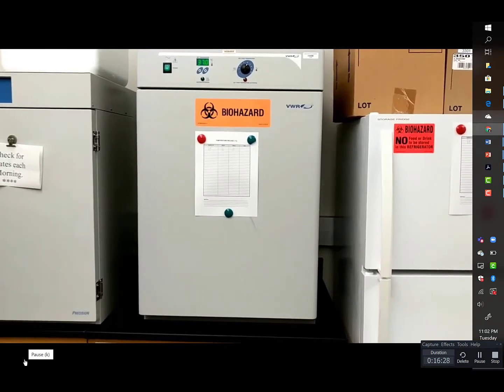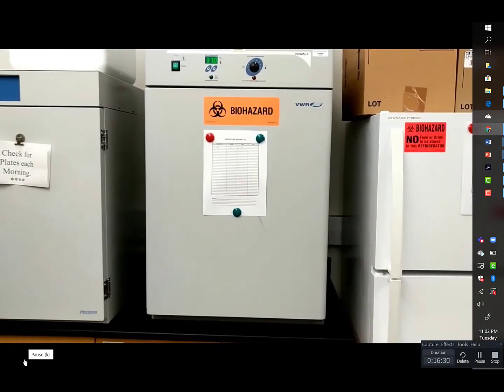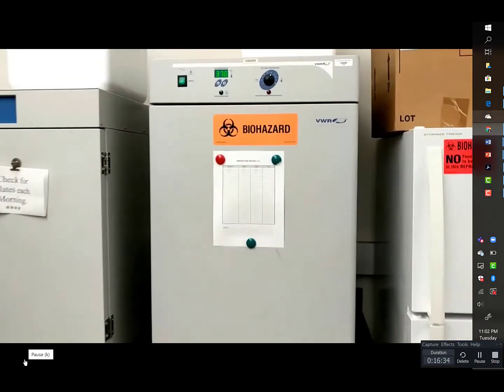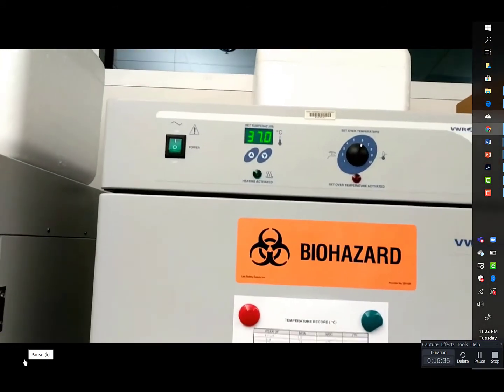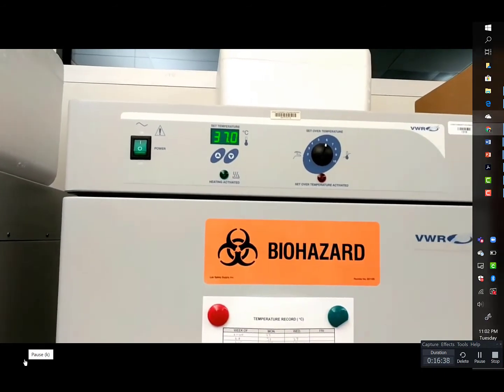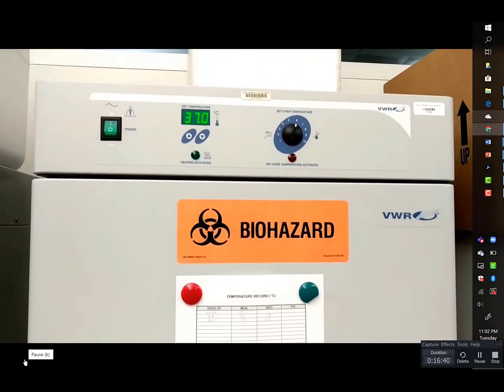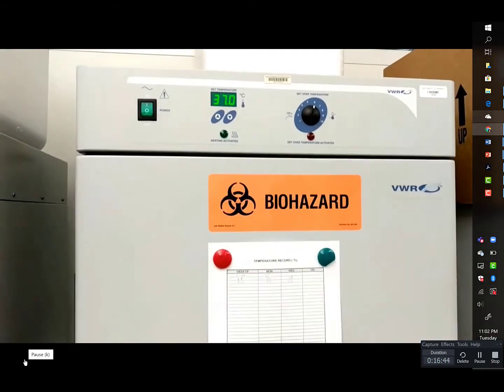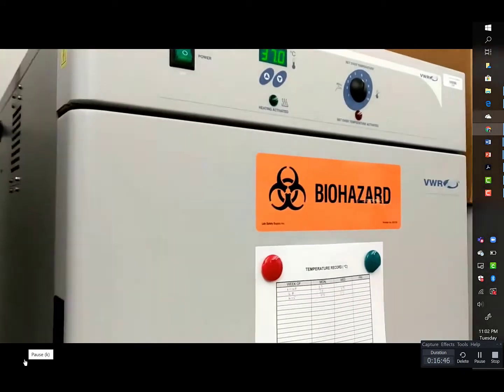Okay, here we are in front of the laboratory incubator. We have several of these in our lab. This one is turned on right now and set to 37 degrees Celsius, which is approximately 98.6 degrees Fahrenheit. That's human body temperature. We're going to be growing these organisms at a very toasty temperature.